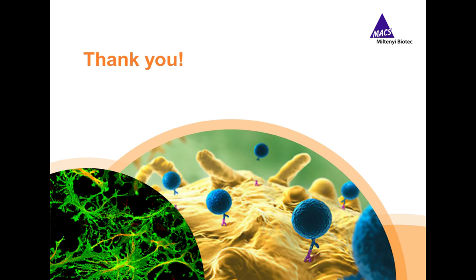Okay, your next question is, can you also stain or isolate adult neural stem cells from other brain regions, for example, the dentate gyrus? The dentate gyrus neural stem cells need another marker combination. The marker combination included in the kit that I showed to you is really optimized for the analysis and separation of the neural stem cells from the subventricular zone. For the dentate gyrus, another marker combination is needed. Therefore, we do not recommend to use this kit for the analysis and isolation of neural stem cells from the dentate gyrus.